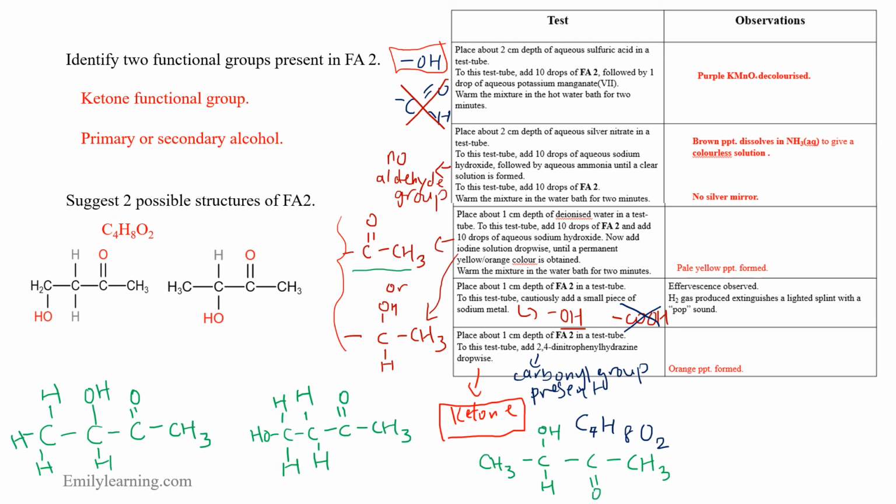And in particular, the carbonyl group is one of the most popular ones because there are just so many tests inside that chapter. Of course, the questions can also come from other organic chemistry chapters, although the carbonyl group, alcohol groups, and carboxylic acid groups will be the most common.